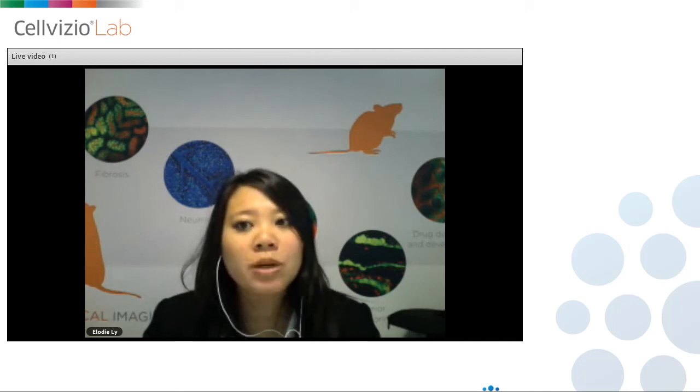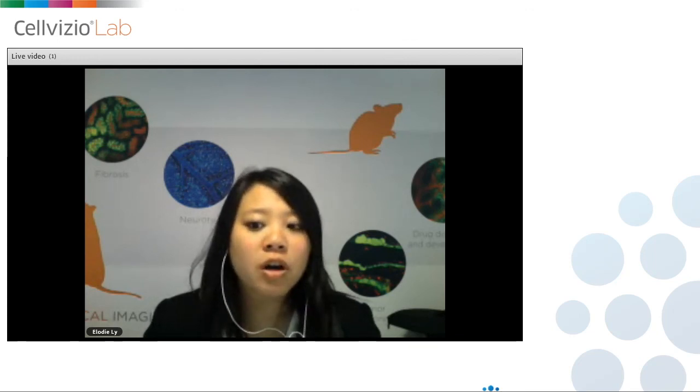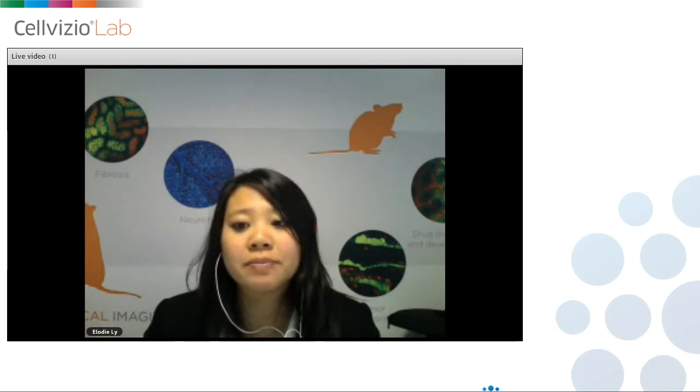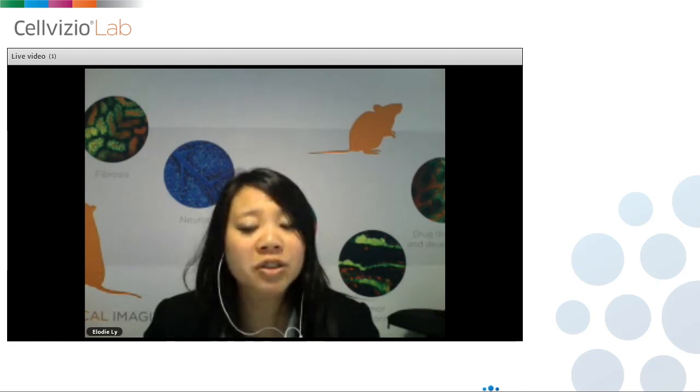Depending on the probe that you are using, you can have from 3.5 to 1.4 microns. So you will be able to detect individual bacteria or individual cells. What you will not be able to do is to look at compartments, what is inside the cell.